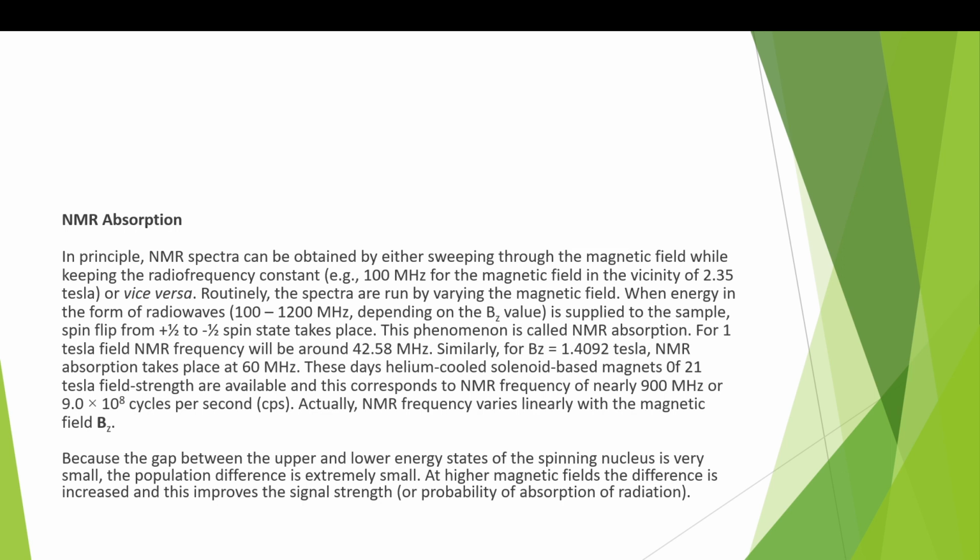NMR absorption. When the radiation frequency becomes equal to the energy gap, absorption takes place. These days, various NMR frequencies are used, beginning from 100 to 1200 megahertz. Accordingly, the magnetic field has to be used. Both are proportional.